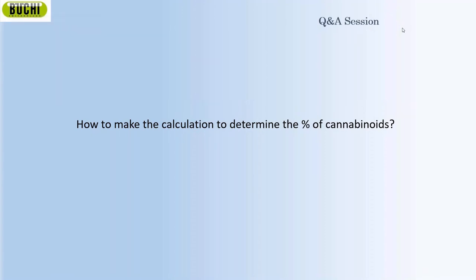So how to make the calculation to determine the amount of the cannabinoids? In this case, there will be two different answers. If you are asking the amount of the cannabinoids in your plant material, then you can go for the ProxiMate NIR device.